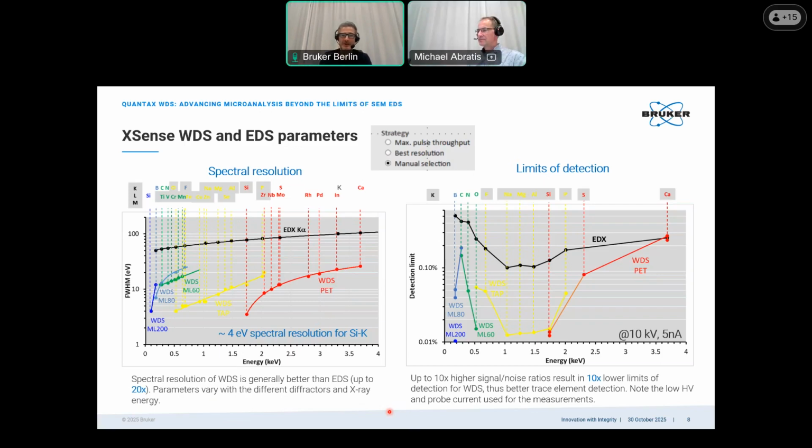Thank you, Michael. There's another question. Does WDS equipment cost more or less than EDS? Let me answer this question more generally. WDS is more expensive than EDS, and that is because it contains a huge amount of mechanical parts, which are definitely more expensive and a little bit more complicated than an EDS detector.